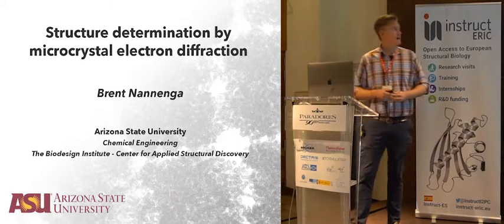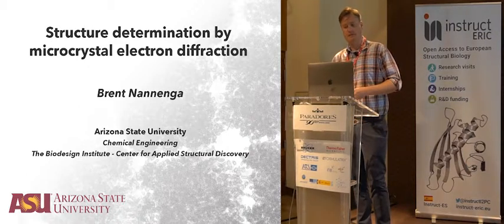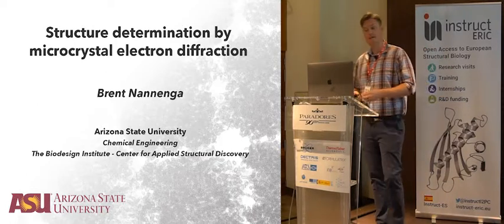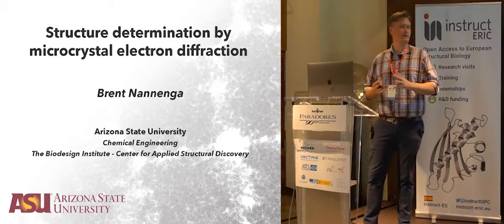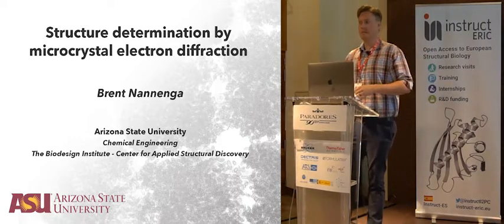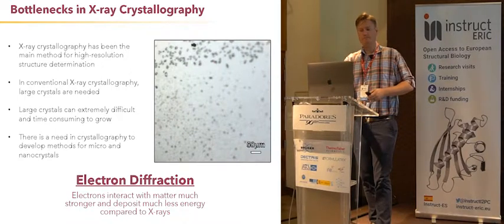So today I'm going to talk about the technique that we've been using called microcrystal electron diffraction, or micro-ED. It's a technique that I developed during my postdoc, and since I've moved to my own lab about 4 years ago, we're continuing to develop this both in my lab and in collaboration with other labs around the country.